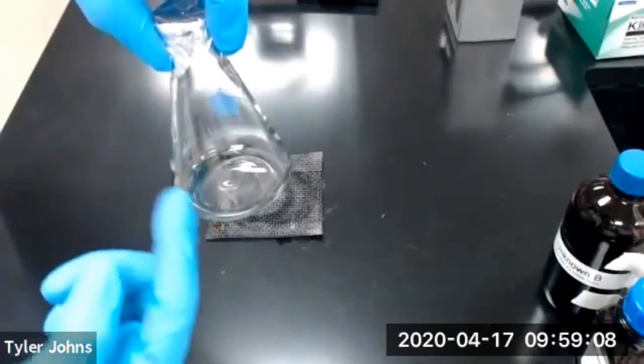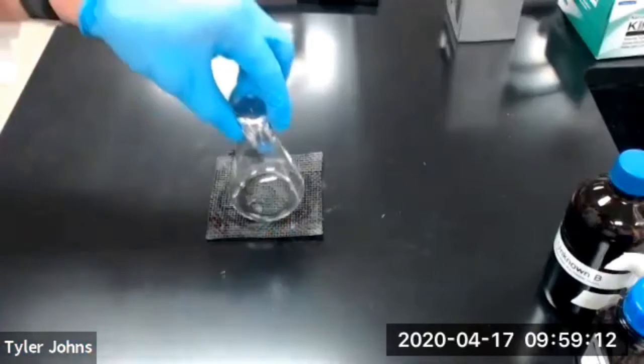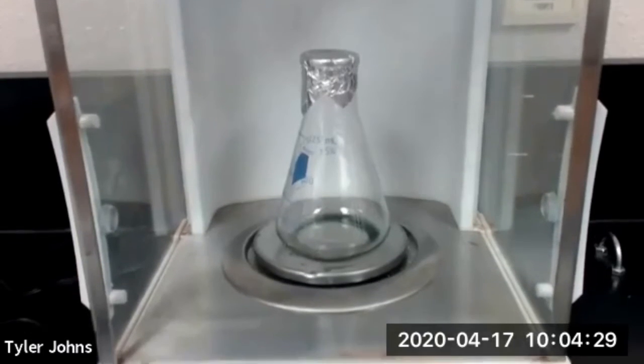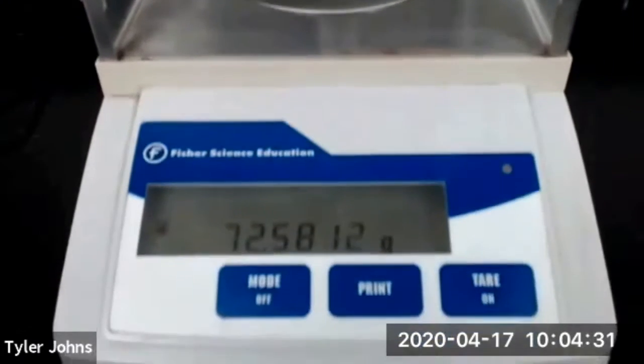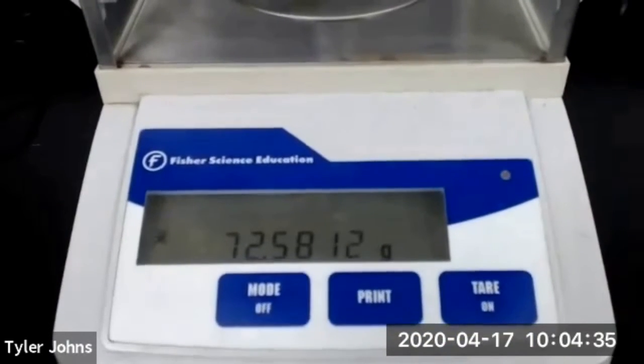Before you do this, you want to make sure that you have the flask completely dry from being in the boiling water. The mass of our flask plus the foil lid and the remaining volatile liquid is 72.5812 grams.